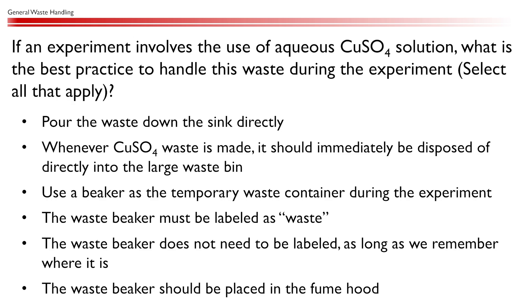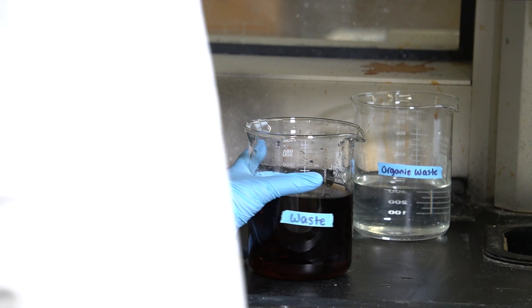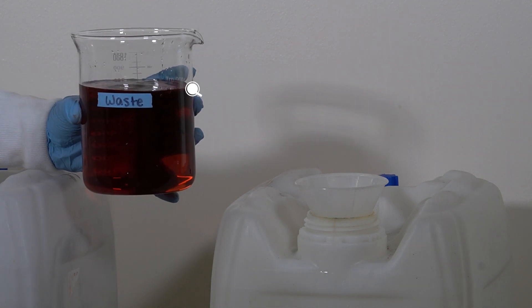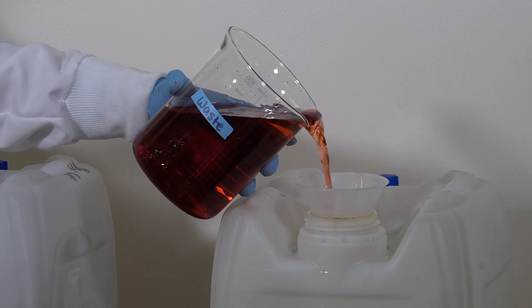If an experiment involves the use of aqueous copper sulfate solution, what is the best practice to handle this waste during the experiment? That's right, you'll likely find it most expedient to use a local waste beaker, properly labeled as waste, that you keep in a nearby fume hood. When the waste beaker gets about 75% full, dispose of it in the larger satellite waste bins.